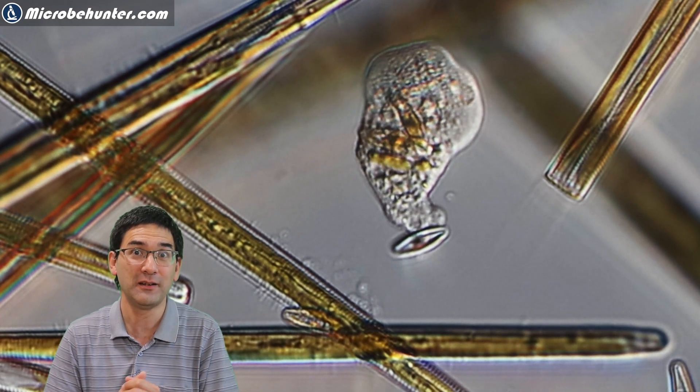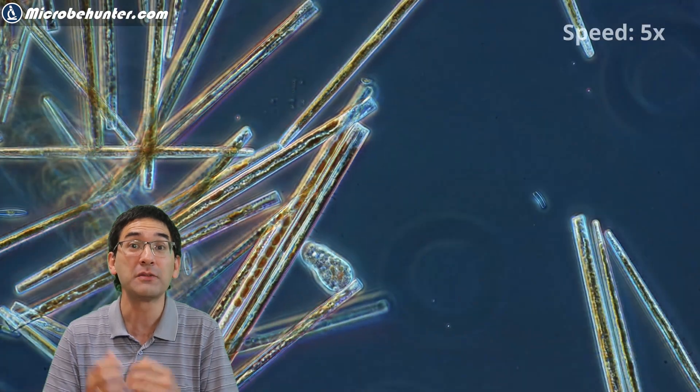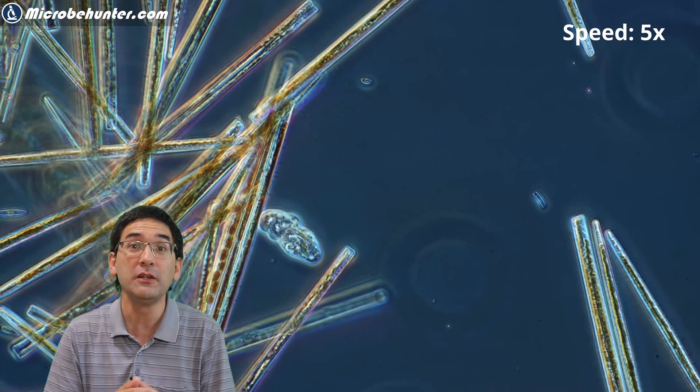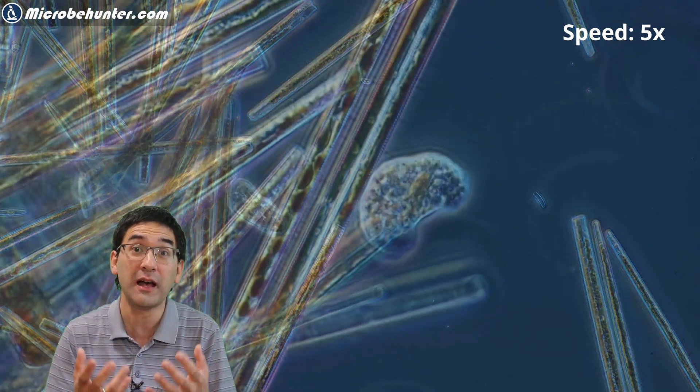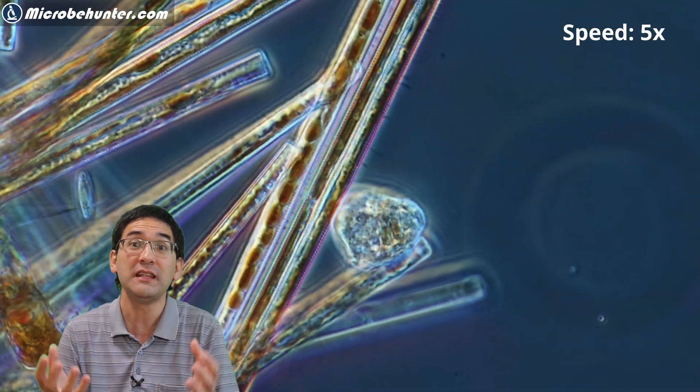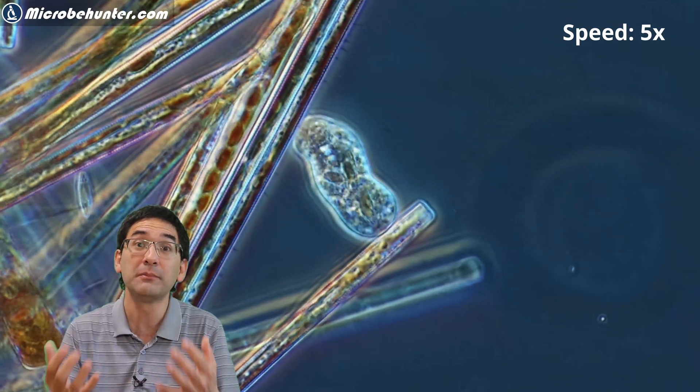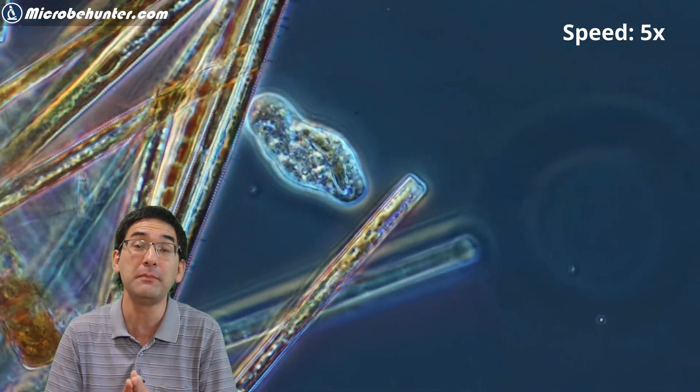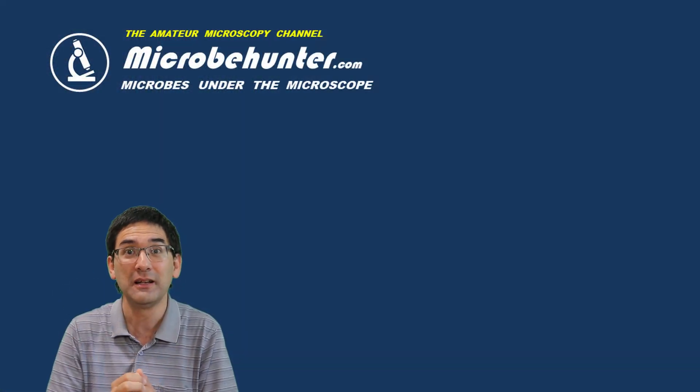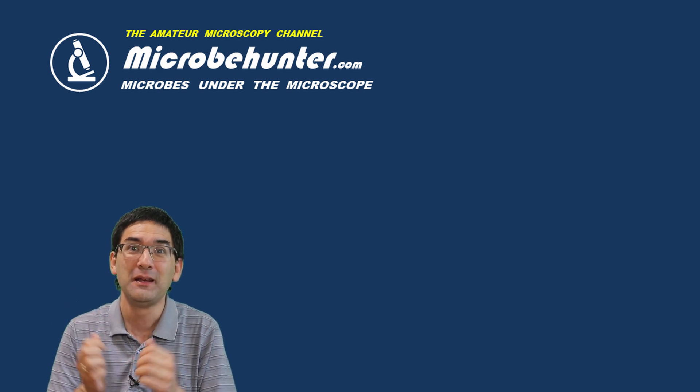Well, I think that amoeba are a very fascinating specimen to observe. However, they're not always quite easy to see because many of them are actually moving fairly slowly, and therefore they can be easily overlooked. They also do not have a very strong stain or color. Sometimes the objects that they eat—the bacteria and algae—actually give the amoeba a specific color, and this allows me to check a little bit in the cell and to see what they have eaten, because the inside of the cell has a different color.